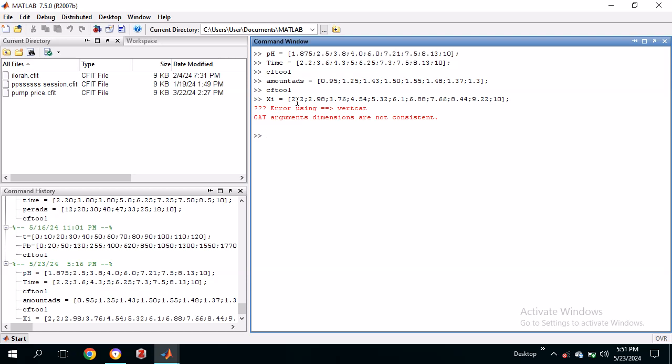When using Matlab, you have to be very sensitive of errors because Matlab is a very sensitive toolbox that when you make a mistake, either in the semicolon or the parentheses or even the data name, it will change everything. So we put the data again, or we can just copy it directly and edit it. So we copy it, then we paste it, then from here we can edit it.